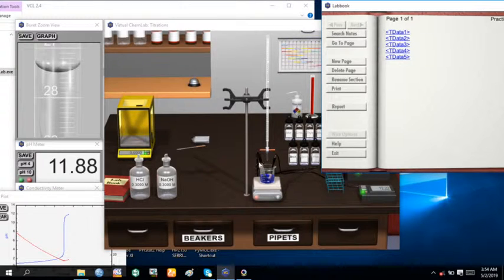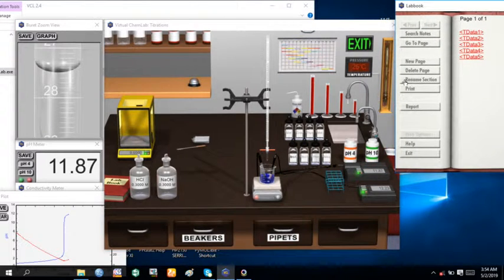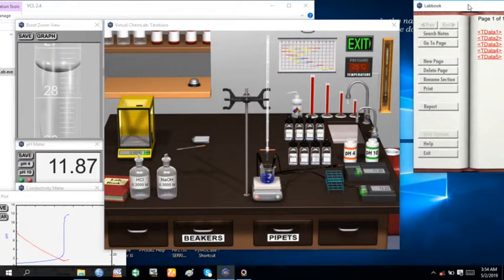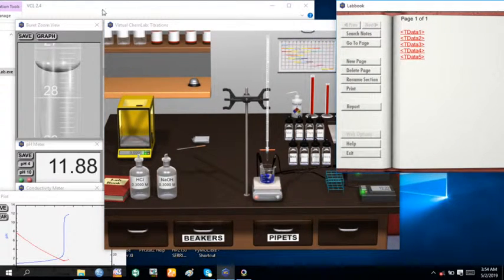You pour away this. There is an opening here where you pour out the experiment. You can start your second experiment again. Go to the stock room.